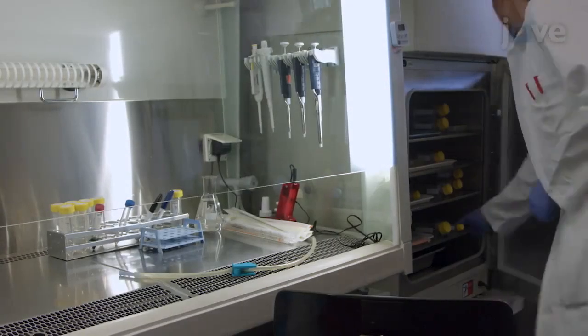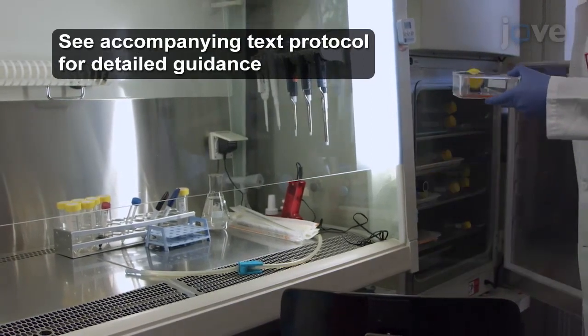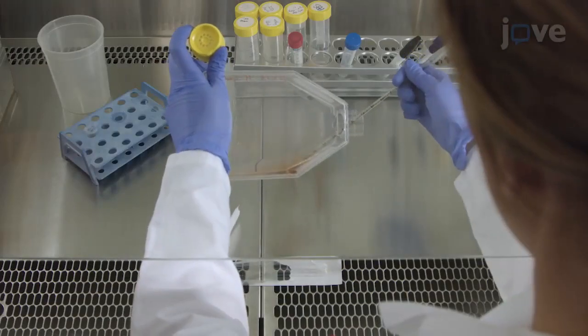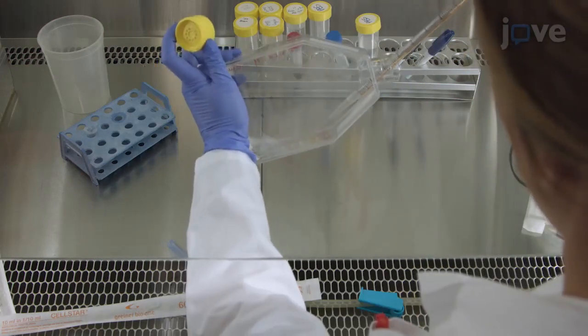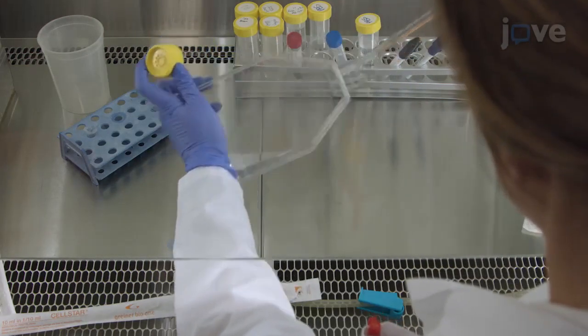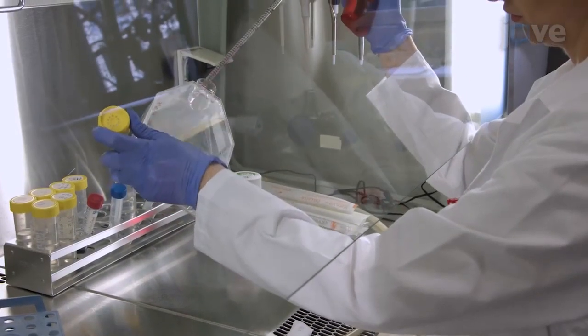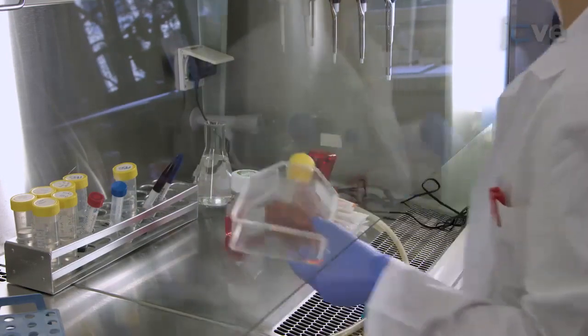To begin the protocol, obtain previously prepared ACC-MESO4 cells with an 80 to 90% confluence. Aspirate the medium, wash the cells with 15 milliliters of 1X phosphate buffered saline, or PBS, and aspirate the PBS. Next, add 3 milliliters of 0.25% trypsin EDTA and incubate the culture flask at 37 degrees Celsius for 3 minutes.